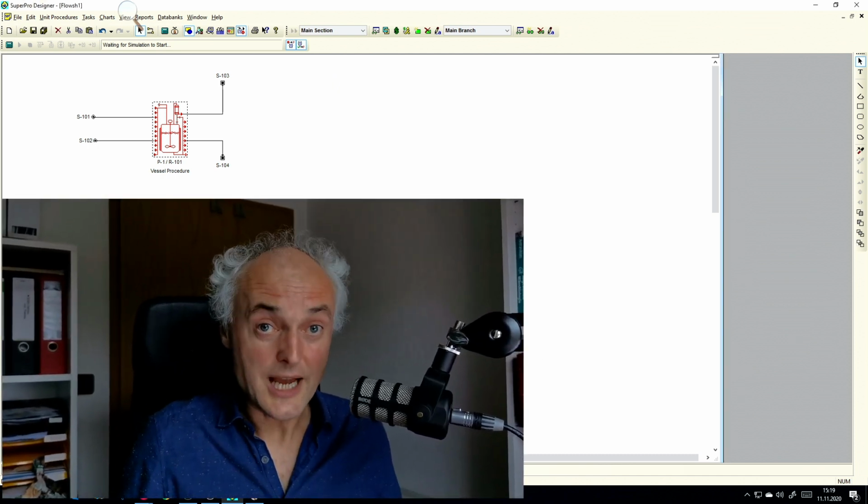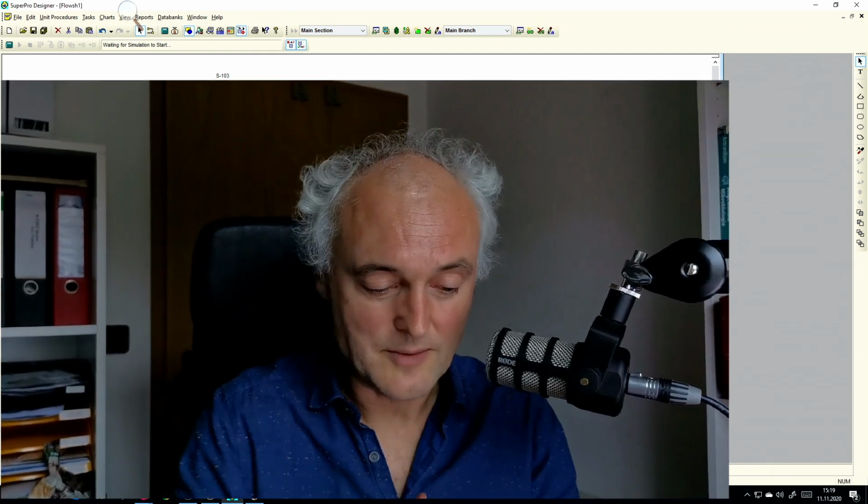So now we're done. We have initialized the streams. We have initialized how much is being charged. We have set the operations. We have set the charge operations. We have assigned a stream to the charge operation. We have told the software how much has to be charged. Then we have set the reaction. So we have put in the reaction stoichiometry. And we set at the end and then just transfer everything out. So we're done. So that's what the software needs.